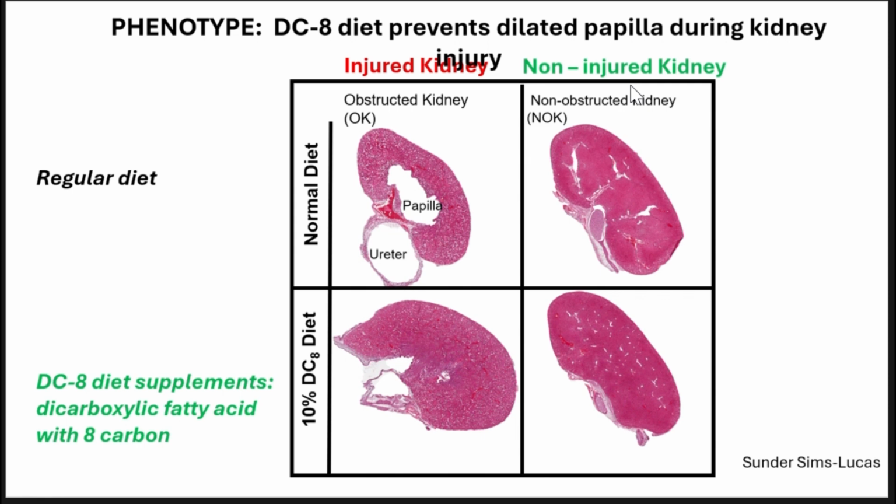The succinylation protects against kidney injury. This is the PTM level effect. This is not a protein level effect. So I want to just spend 2-3 minutes on my last bone proteomics work.